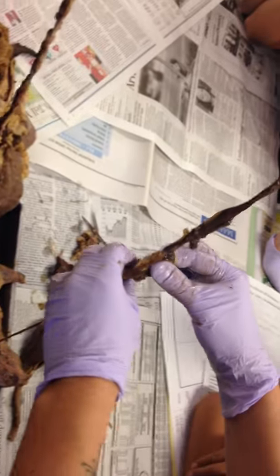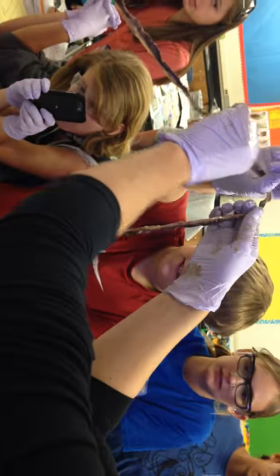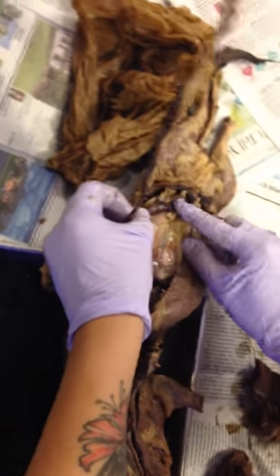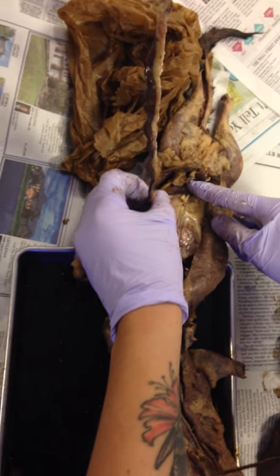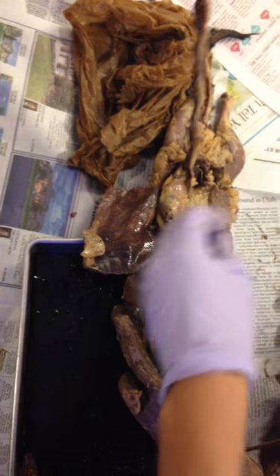So this is my what? Esophagus. My esophagus turns into my stomach. Stomach turns into small intestine. You can see that in a lot of them, they suddenly get a little bit wider and fatter. The last couple inches is your large intestine. So I can remove that fatty mesentery.